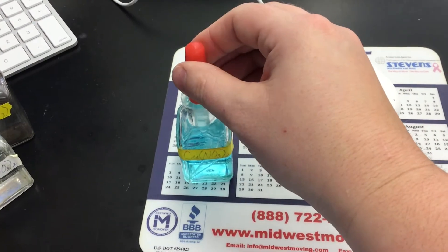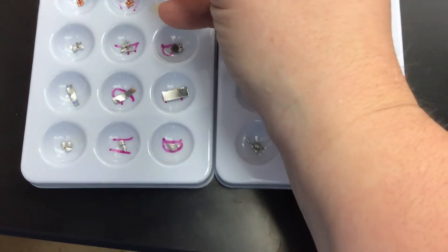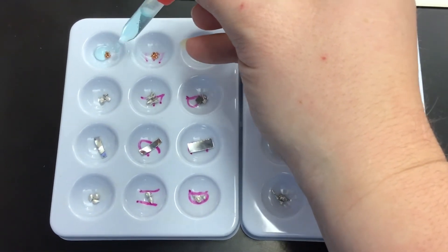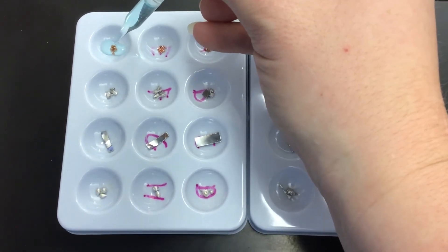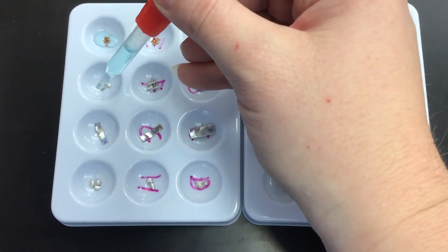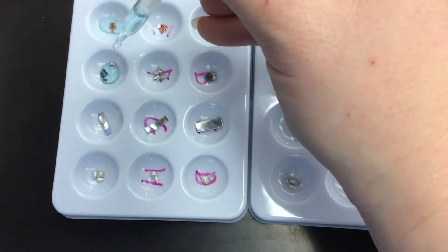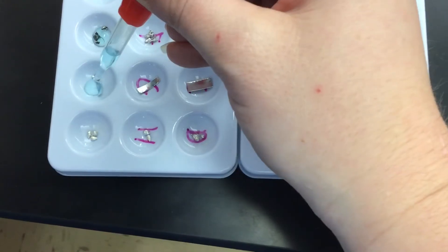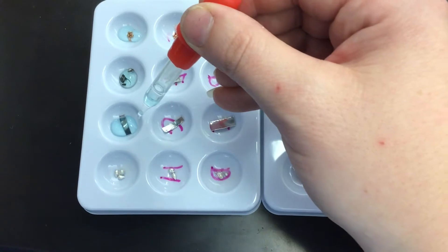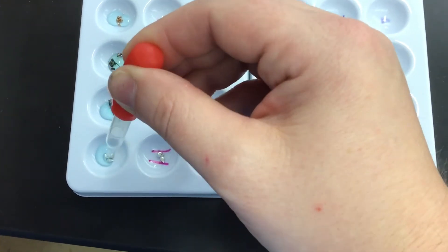We're going to fill our dropper and put enough copper nitrate into the first well with copper to cover it — two or three drops should be enough. Then we'll go down and put two to three drops of copper nitrate with the magnesium, two to three drops with the zinc, and two to three drops with the tin.